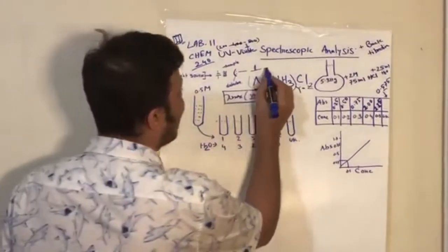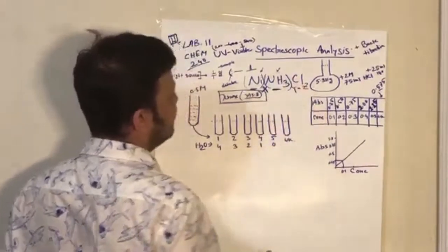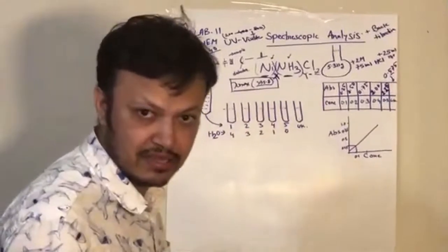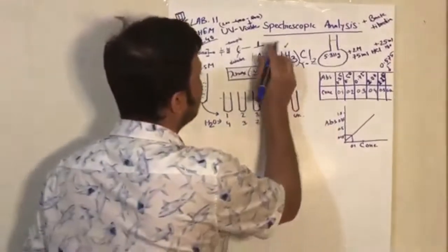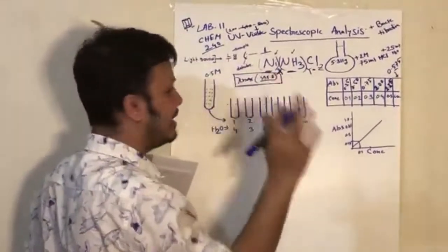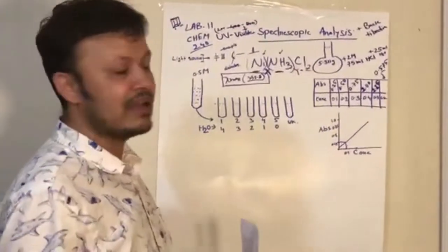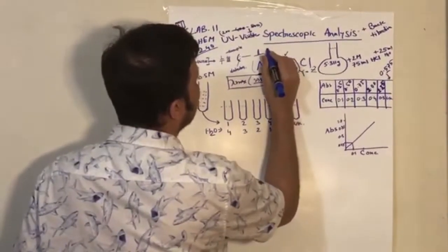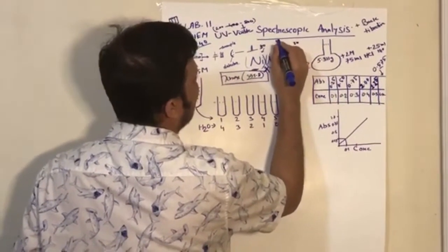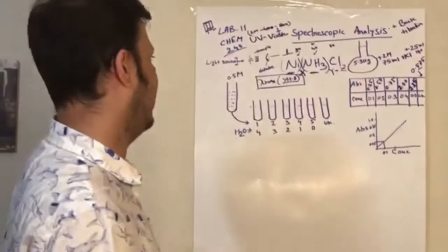Once you know the amount of the nickel and the amount of the ammonium, the rest of it is what? Chlorine. It's easy. You know the amount of the nickel with the help of the spectroscopic analysis. How to do that, I will let you know. Then ammonium is from the back titration, and chlorine is the rest. For example, if it is 40% and 30%, the rest, 100 minus 70, is 30% chlorine. We can find that out anyway.